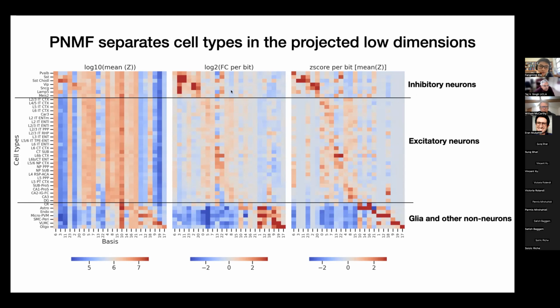Specifically for the brain, we know there are three major cell types: non-neuronal cells on the one end, and for neuronal cells, two broad groups, excitatory neurons and inhibitory neurons. Within each group, there are subtle differences among them. You can see that this algorithm in general does a good job capturing those general relationships. Although for our purpose, what's undesirable is that we care a lot more about the subtle differences among neurons than the big differences between different non-neuronal cells, because we know a priori that there is a lot of diversity among neurons that's interesting and we wanted to capture.